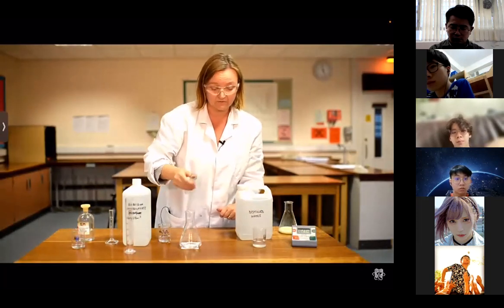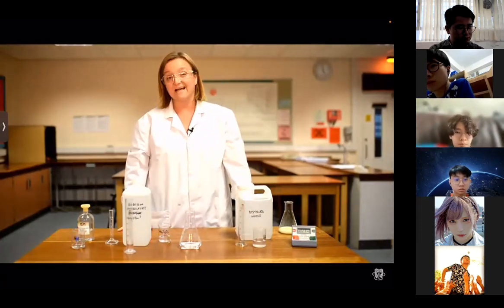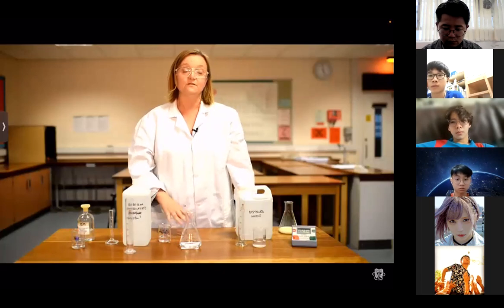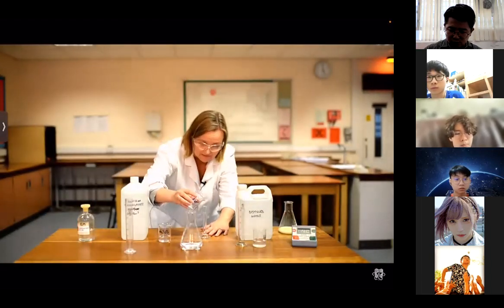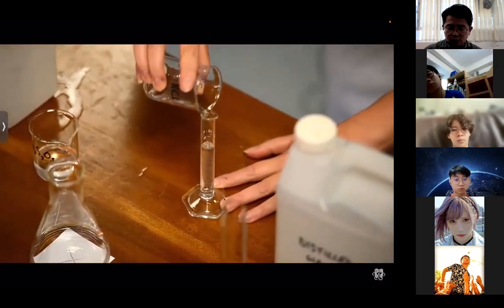We need to think, how is this going to affect the rate of reaction? A reaction occurs when particles collide, and that collision has got to have sufficient energy for the collision to be successful. By diluting the sodium thiosulfate, I've got the same volume but fewer particles, so a collision is less likely. Within a minute or a second, we're going to have fewer collisions and therefore a lower frequency, and in theory, a smaller or lower rate of reaction. To start it off, I'm going to add my 10 centimetres cubed of hydrochloric acid, being careful again to get the measurement accurate.